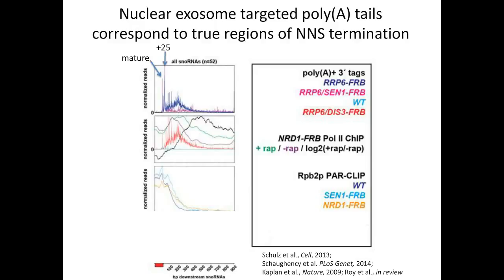We also compared it to other data that had looked at RNA polymerase II PAR-CLIP cross-linking to RNAs that are bound to RNA polymerase II in wild-type cells, as well as in cells that have the NNS pathway compromised with either the SEN1 mutation inactivation or the NRD1 inactivation. And we can see that the NRD1 inactivation gives a clear inflection point where the RNA polymerase II is no longer terminating and begins to accumulate downstream.